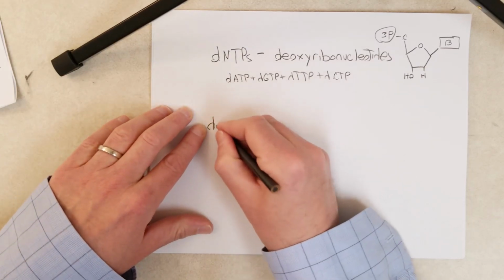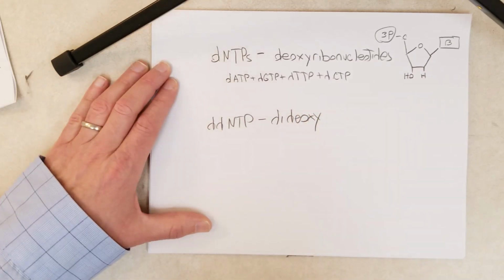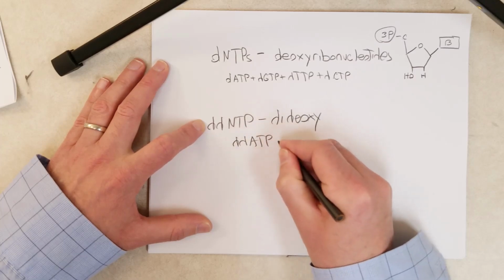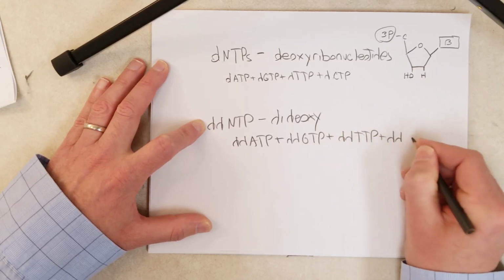So ddNTP stands for dideoxyribonucleotide. And it means ddATP, ddGTP, ddTTP, and ddCTP.